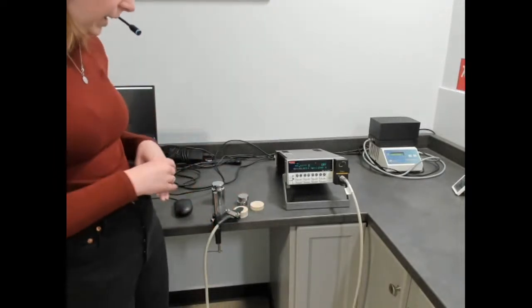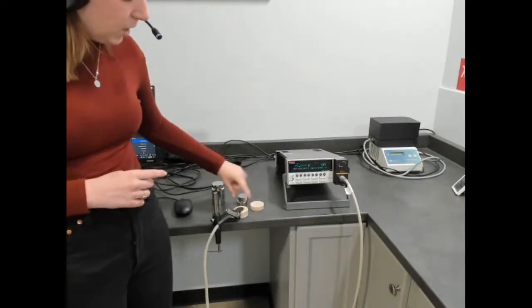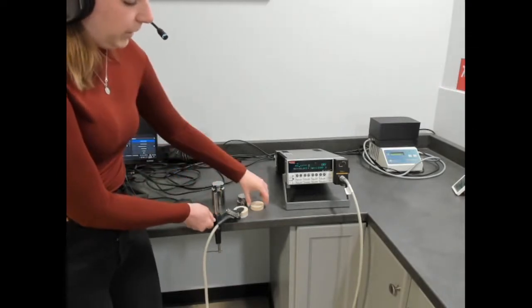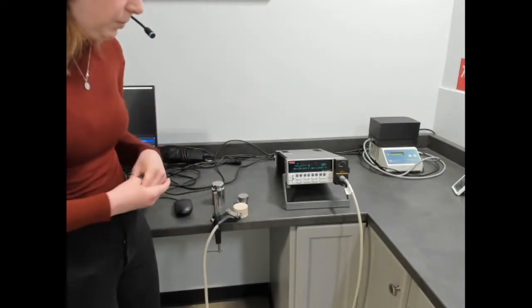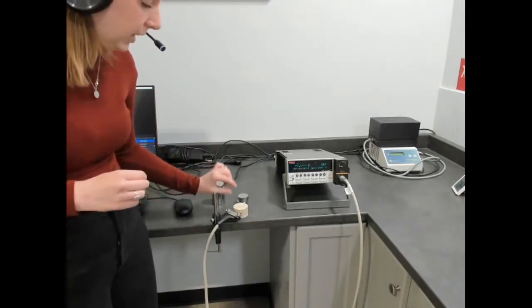Today we're going to be setting up PyroCeram in symmetric configuration. So you just want to place one sample underneath your sensor and then adjust the height so that it's level with the top of your sample, and then place the other sample directly on top. The minimal sample size for the TPS-3 is 40 millimeters diameter and 5 millimeters thick.